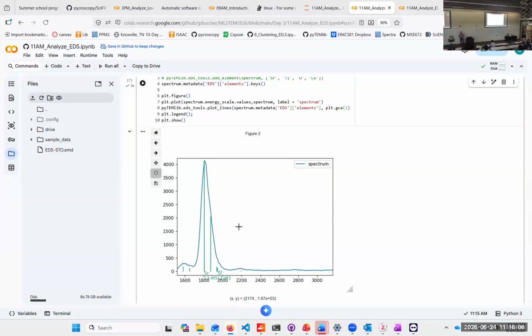I determine this is strontium, it's a strong peak, it has to be a very strong line. So it's almost unambiguously strontium, so it's not much things you do. And then I say, okay, if this is strontium, what other lines do I expect of strontium in my energy range? And I subtract that. Okay.